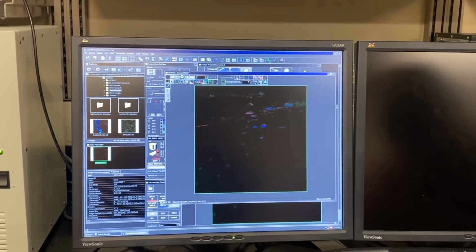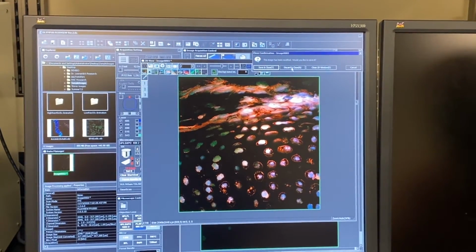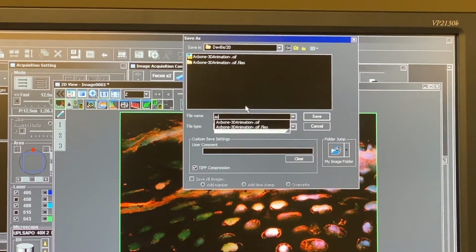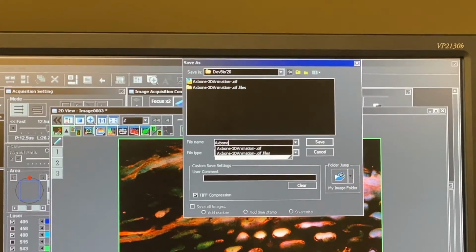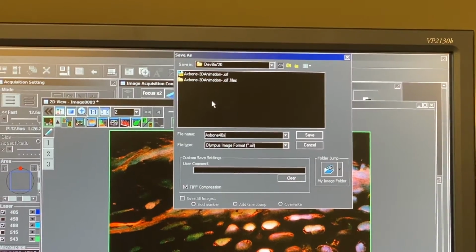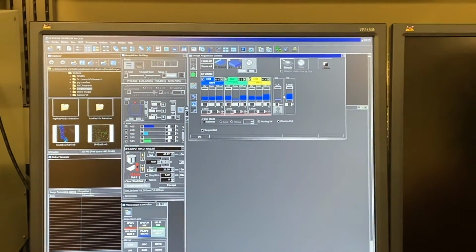Let's also save our Z stack or Z series. So we have 9 pictures in a series, in a stack in the Z direction. So I hit close. I don't want to discard it. I want to save it. And so we'll call it the same thing. But this one is not. And I'm going to label here as well that we did this at 40x. There was no cleaning up, which is called Kalman averaging. There was no optical zooming. So this was the basic type of picture that you can take.